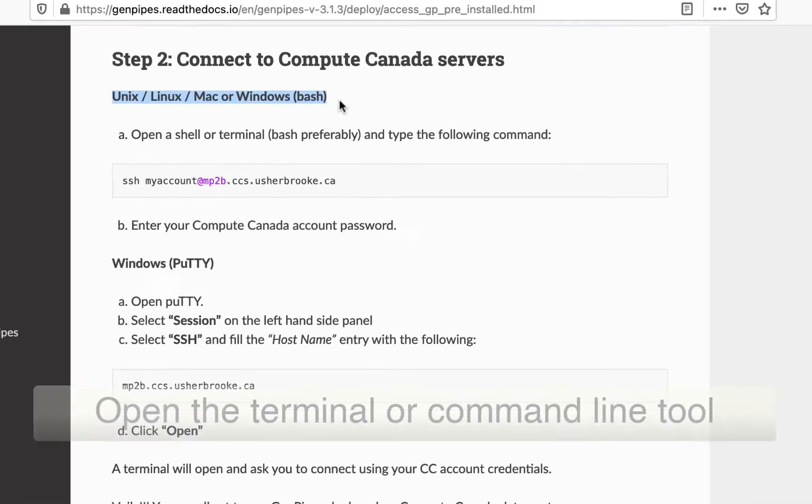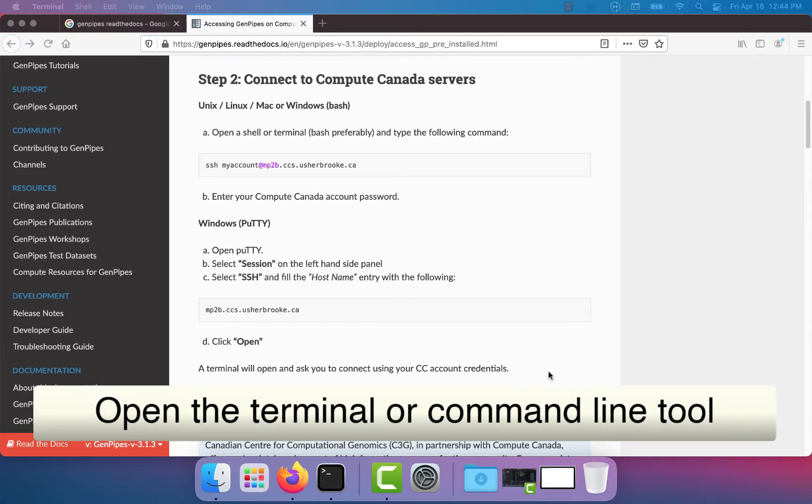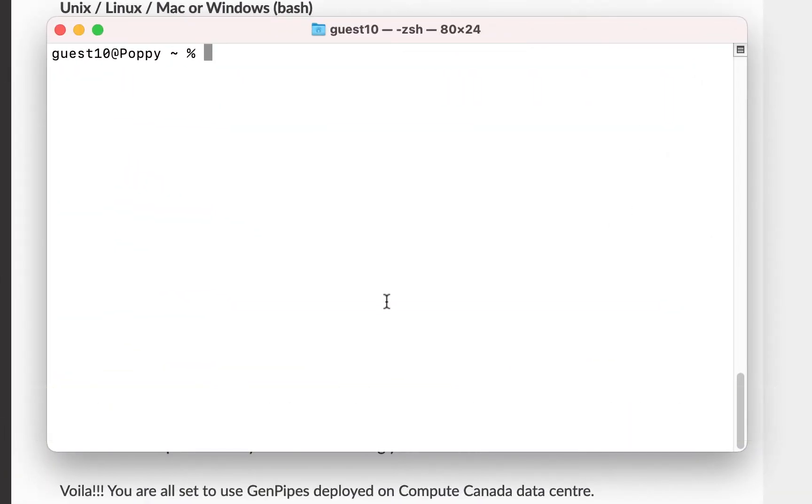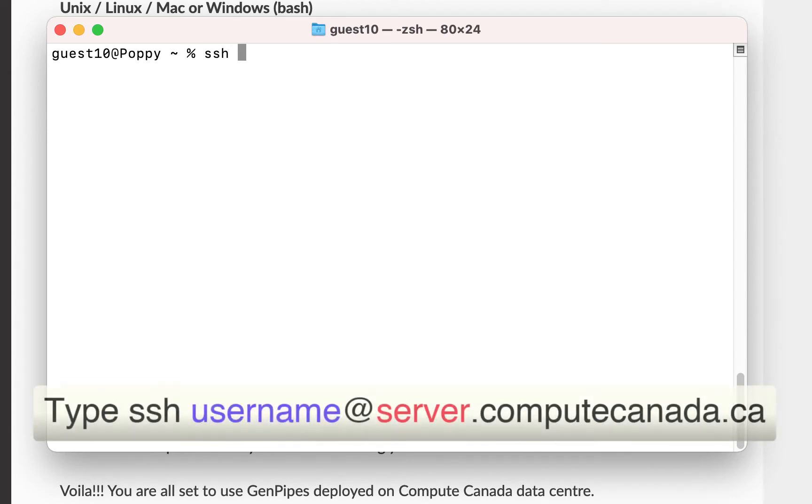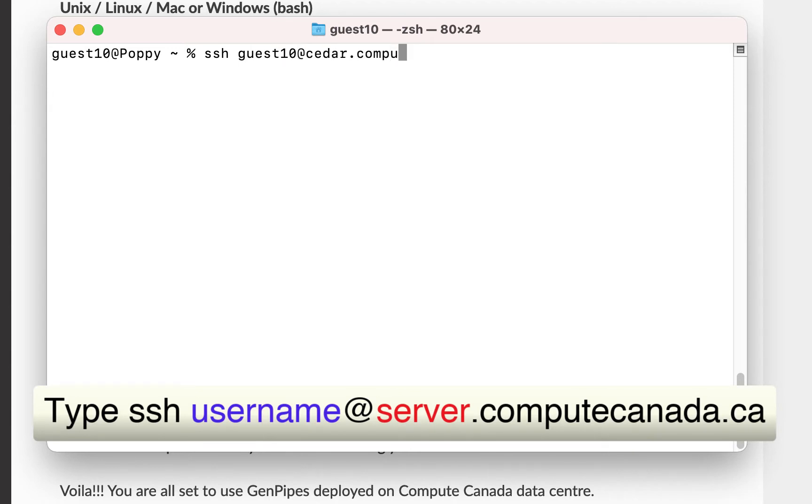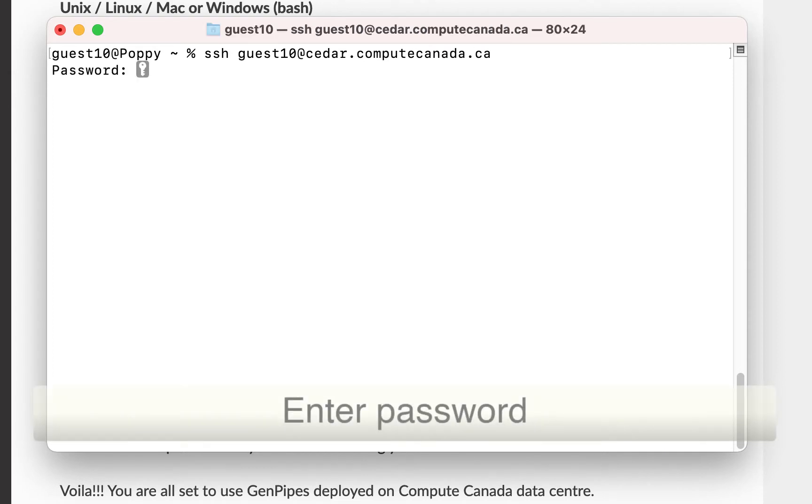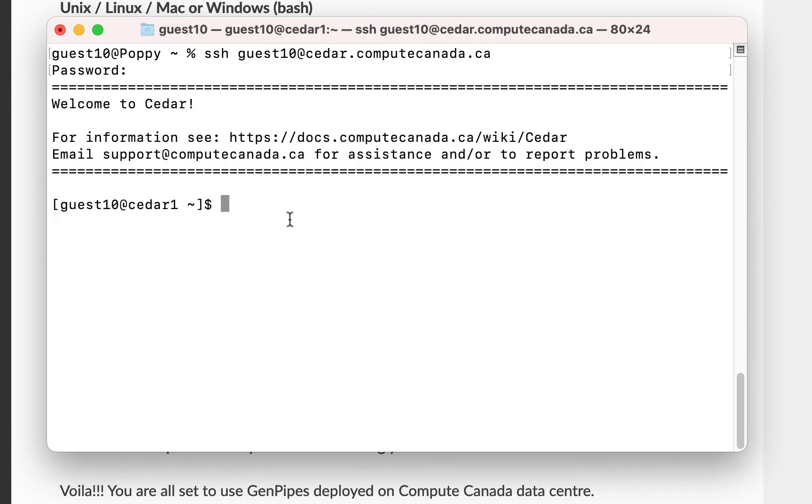Next open the terminal or the command line software you installed on Windows and access the cluster using your Compute Canada credentials. For that type SSH space and your Compute Canada username at the name of the server you are trying to log in .computecanada.ca. Then press enter. Type your password and log into the cluster.